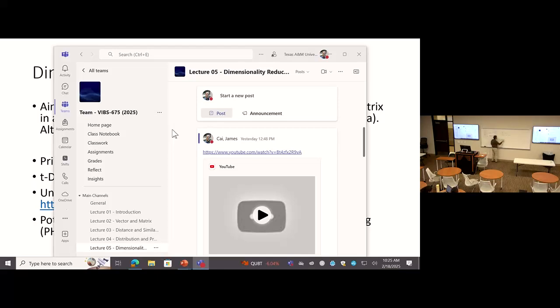So this variation, remember you have different statistics. You can define the variation. You can use variance, you can use a standard deviation, you have a CV, so many different ones. But at the core of that, you compute the distance. Basically, this is a distance, this is another distance.